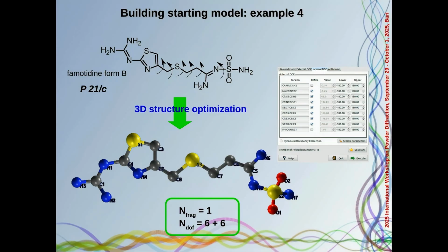But sometimes I know that in my molecule some parts have fixed geometry. The typical example is a double bond that is not in a ring. For the program, this double bond is a rotatable torsion. But in general, you know that the configuration around double bonds is planar. So if I want, I can introduce this information in the process of optimization.